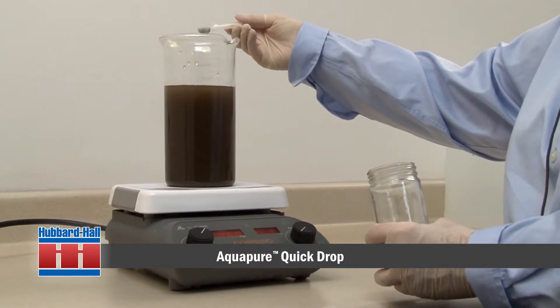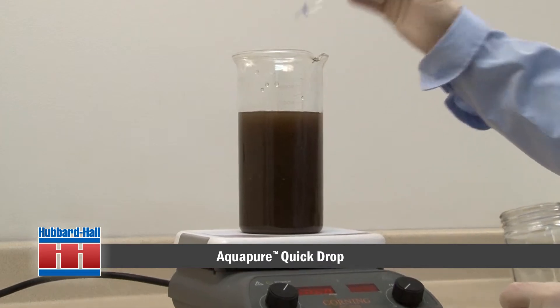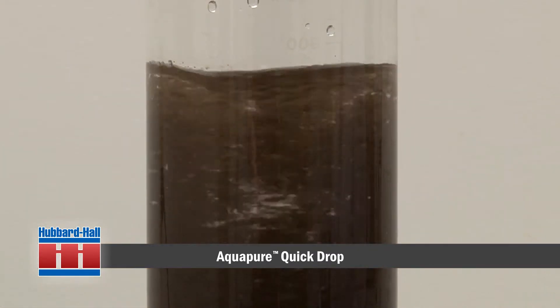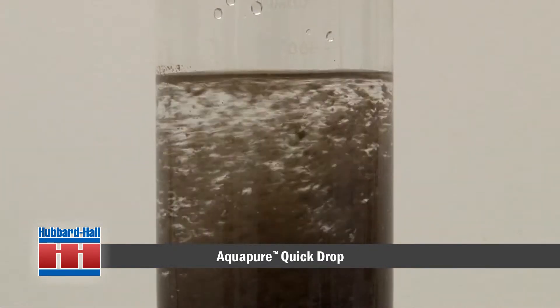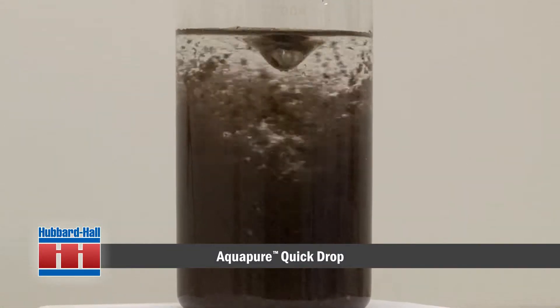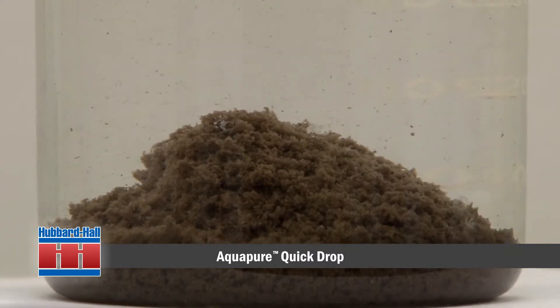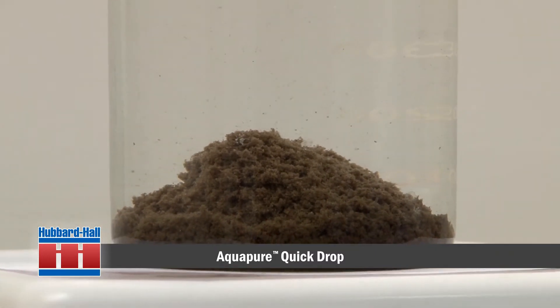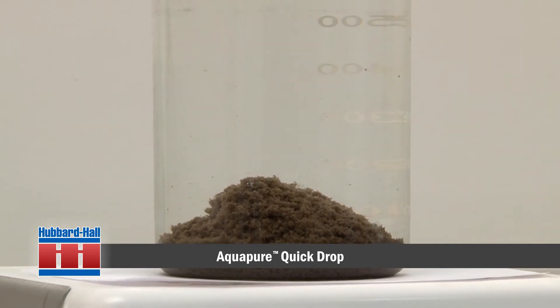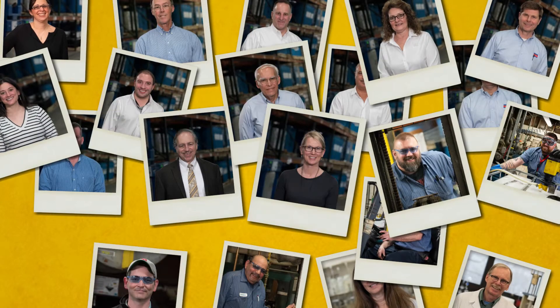A small amount of Aquapure Quick Drop will now be added to a beaker of wastewater. While the solution is mixing, you can see the solids quickly separate from the water. The bentonite clay portion of Aquapure Quick Drop offers great absorption properties. Through absorption and conditioners, the precipitated particles in the water are massing together for easy dropout.